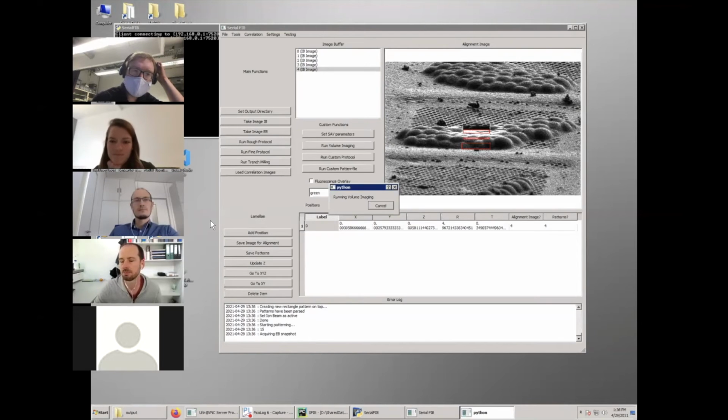Because focusing of the SEM, you mean? Mm-hmm. But wouldn't it change? So you need to focus somewhere on the block face itself, right? Yeah, you would have it in the same. You would also be milling it, but this would be just like an auxiliary area for focusing, where you would have milled lines which would go deep, and you would also mill them. But because they would be like a pattern, maybe the charging would not be so strong. Mm-hmm. I mean, I don't know. It's actually a good suggestion, I think. So kind of like a sacrifice position. Mm-hmm.